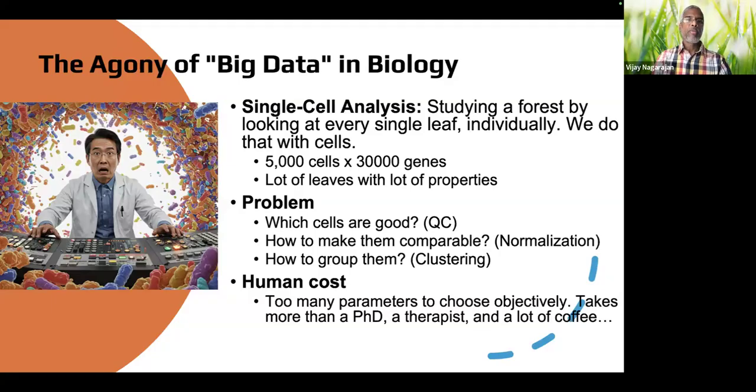So you can assume every cell as one experiment. Every cell has about 7,000 to 8,000 genes expressed. So one cell in itself is an experiment, right? Imagine you have somewhere between 500 to 600 cells in a single cell experiment, all the way to 10,000, 20,000 cells. Even if you take about 5,000 cells in the middle, they're going to have different combinations of the 7,000 to 8,000 genes expressed. So imagine the number of data points that you collect from there.